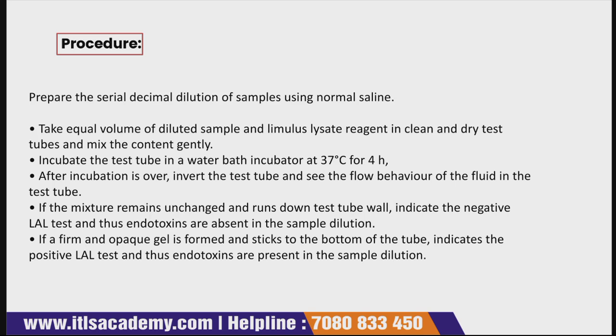So what are the things that are required? You take an equal volume of diluted sample and Limulus Lysate reagent in a very clean and dry test tube, and you have to mix it very gently. The volume of both the diluted sample as well as the Limulus Lysate reagent should be equal.